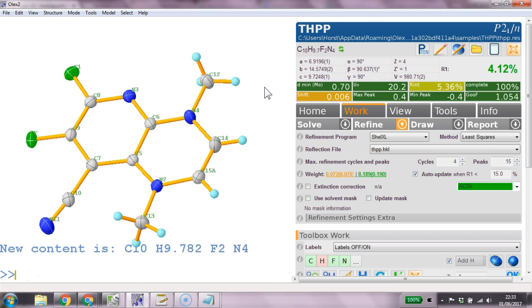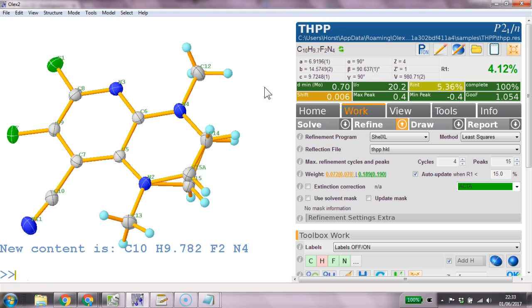Again show p again without an argument. We'll just show both of those parts again. I think this was pretty much everything in order to solve and refine this with the keyboard.